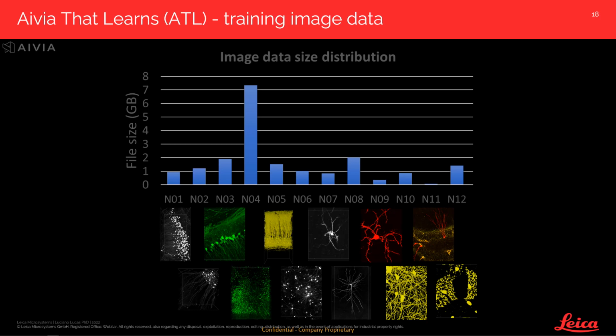We took these images and we asked a group of experts to analyze them using Aivia, while keeping the system that tracks their user behavior on. This is, of course, an opt-in feature in Aivia, but we did that with internal users.